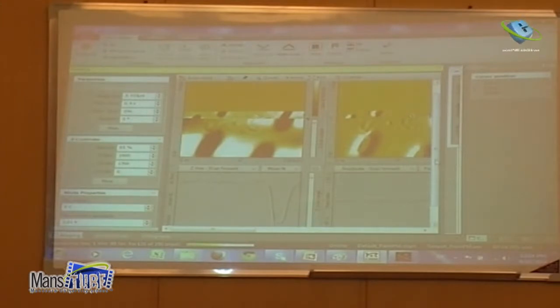We do them in like 2 hours, 1 hour 50, 1 hour 30. For the liquid, I mean, liquid is easy. I just show you how to put liquid, put image, and we scan. So maybe 1 hour is okay. We always make it contact mode or dynamic mode. Lithography is more complicated. Spectroscopy is more complicated. It needs at least the same time as lithography.